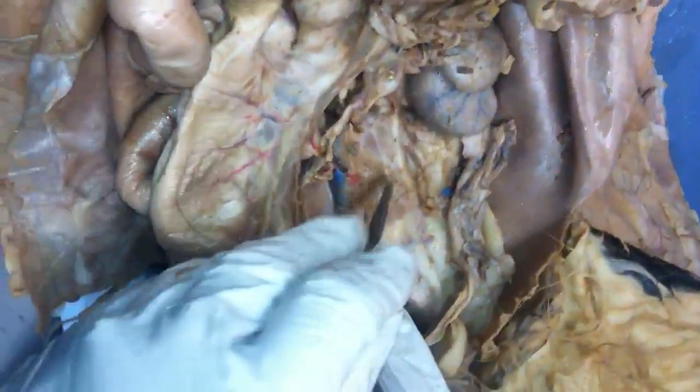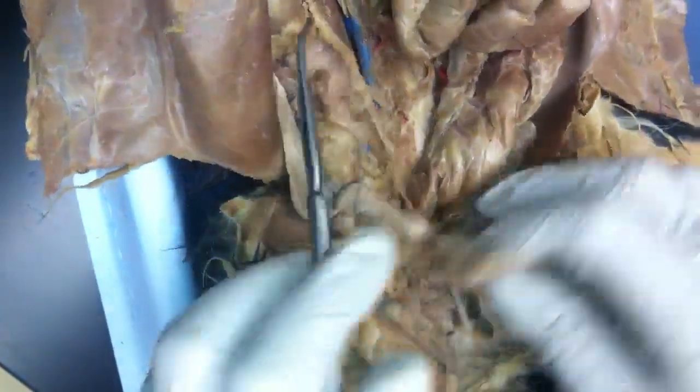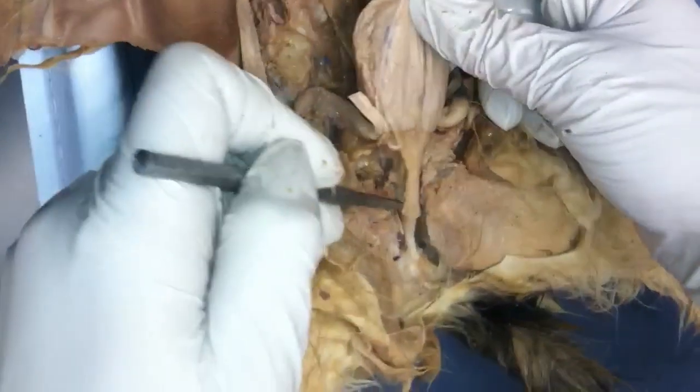And the kidney then sends the urine down into the ureters, which looks like that one's still under the membrane. This one, it's that tube that goes from here down to the bladder. So that's the ureter, urinary bladder, and urethra.